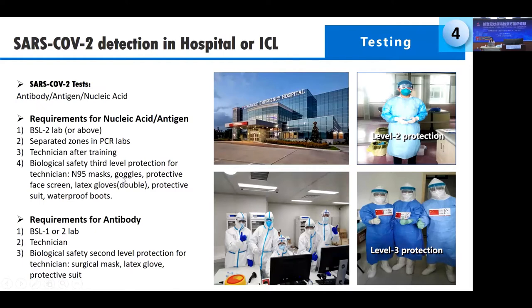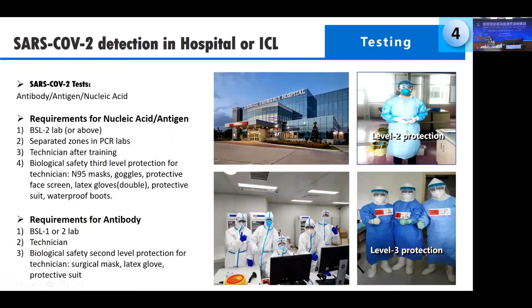Biological safety level 3 protection for technicians requires N95 masks, goggles, protective face shields, double gloves, a protective suit, and waterproof boots — required for nucleic acid and antigen testing. For antibody testing, the requirements are simpler; it can be done in BSL-1 or BSL-2 labs with only biological safety level 2 protection: a surgical mask, latex gloves, and a protective suit. All detection must be done in a hospital or laboratory.